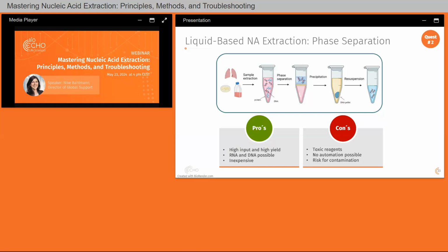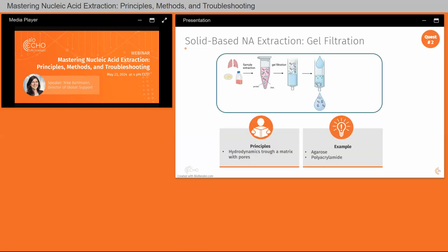And the next step is gel filtration. There is a nice method based on hydrodynamics where you can apply your lysate on a column, and then with the right running material, it flows through the column. This is usually combined with anion exchange for high molecular weight. But there's also a famous gel filtration around, which you all know, the agarose gel. There this method is also used. You apply your DNA molecule and, based on the size, it flows through the gel material. Usually it's just by gravity, or in the case of gel electrophoresis, by electricity.